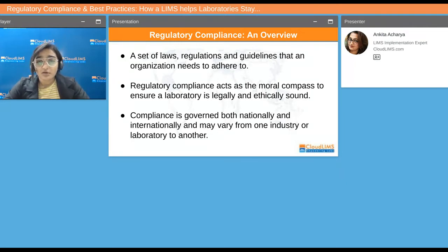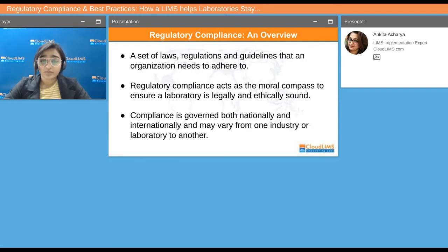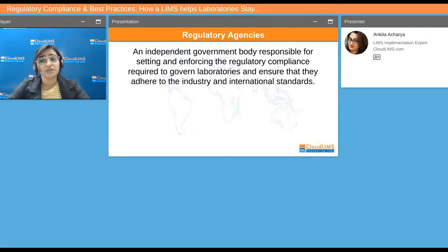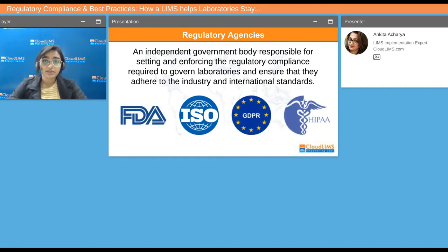So who takes care of these regulatory compliance? Who addresses them? Who sets them? Those would be your regulatory agencies. Regulatory agencies are independent government bodies responsible for setting and enforcing the regulatory compliance required to govern laboratories and ensure that they adhere to the industry and international standards. Some of these regulatory agencies include the FDA, the ISO, the GDPR, and HIPAA. We will be discussing each of them a little more in detail shortly.